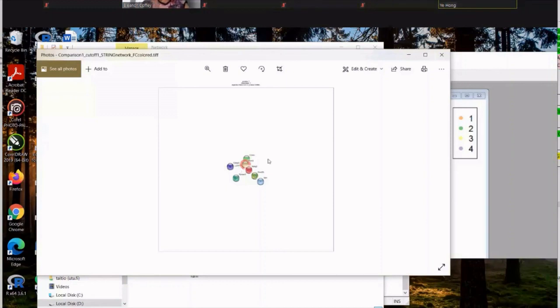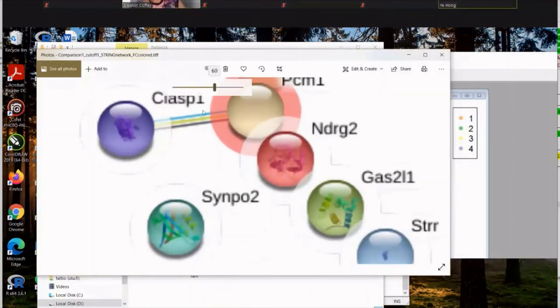Are these physical interactions or gene expression interactions? I think it has everything combined, I don't think I filtered on that. Because it's done on different databases, or different sets, there are different colors over here. I don't actually know how they define different sets. So if one goes to the STRING network, they will tell what these colors mean, right? I would think they should. That's great.